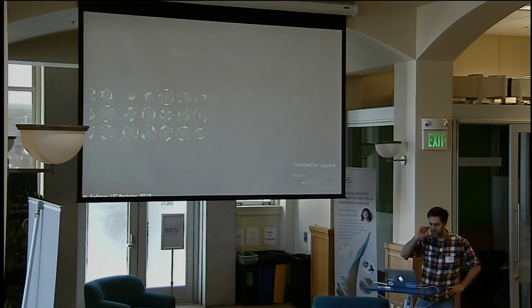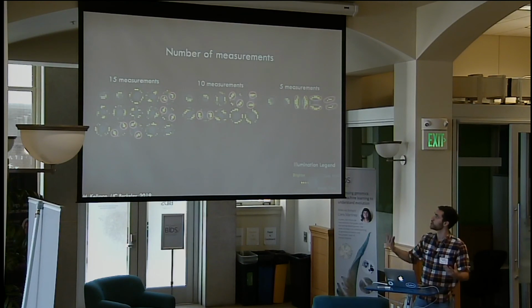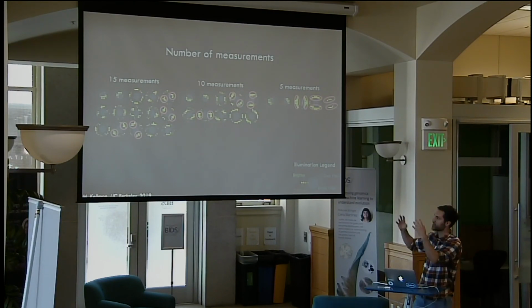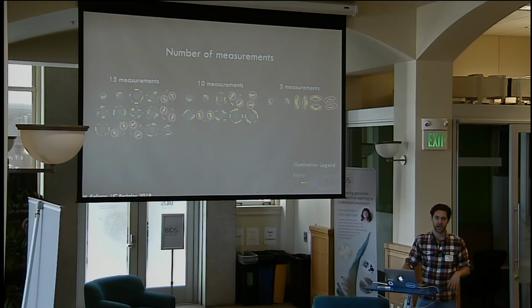As we decrease the number of measurements, these clusters become larger, where we are packing all of the information into fewer measurements. You can see the clusters tile the space. Because we have fewer measurements, we have to pack more information into each measurement.